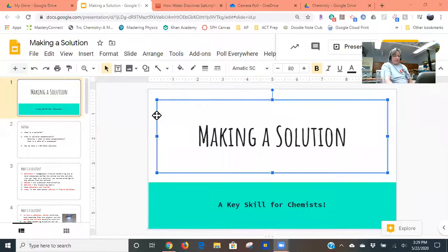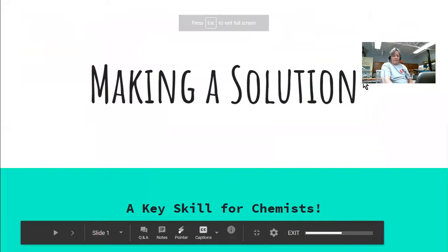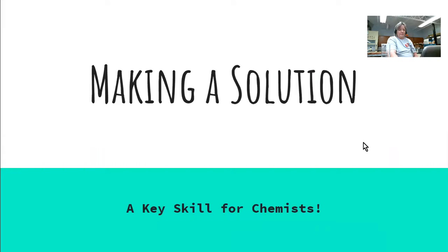So let me share the screen with you, and we will talk about how to make a solution. Then we're going to actually make one in class. Making a solution, a key skill for chemists.